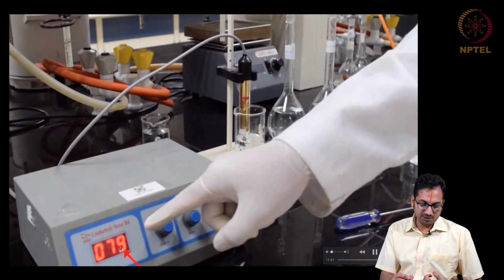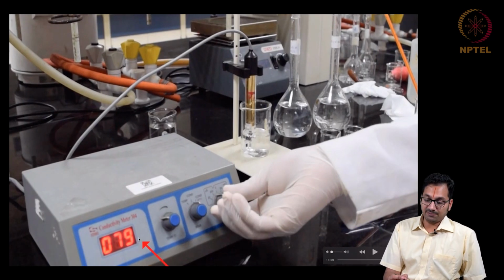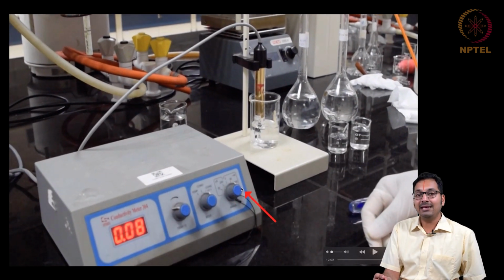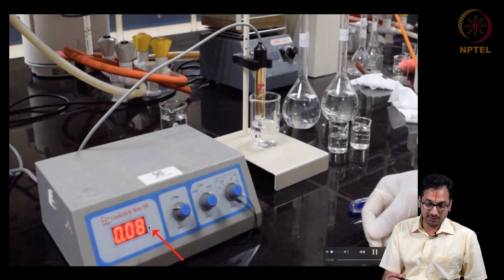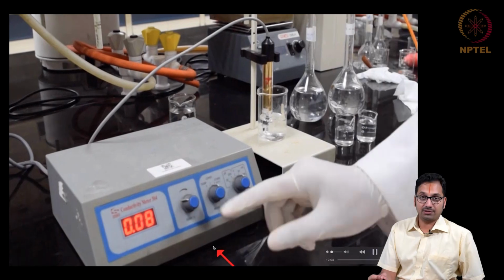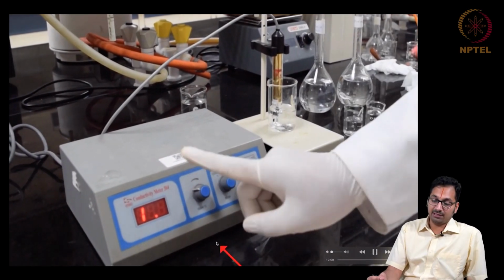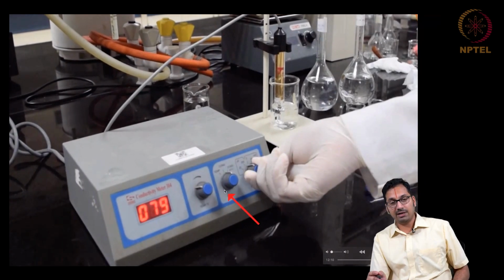Now that is done, you are able to realize the value of conductivity has now increased from 63 microsiemens to 79 microsiemens. Of course, he will probably try to show that if you are increasing this to 1 millisiemens measurement, you are losing the last significant figure that comes up, and it ends up rounding off the figure to 0.08, which is not a good thing. So do not do that. So one has to be careful doing this, otherwise this also results in a systematic error in the measurement. You should also not have a lower value, because that ends up creating trouble.